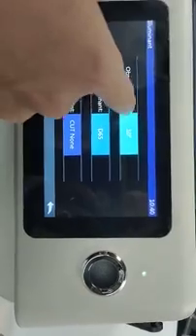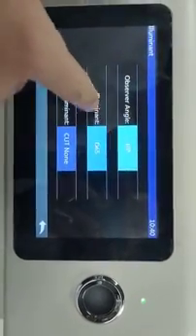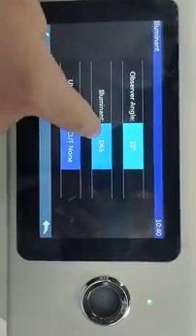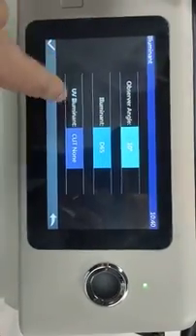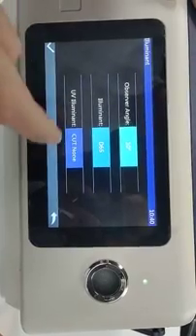Illuminant. You can choose the observer angle here and the illuminant and if you want the UV illuminant.